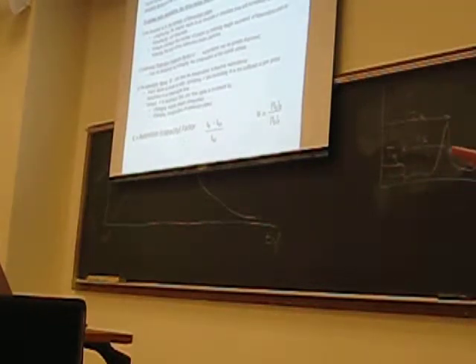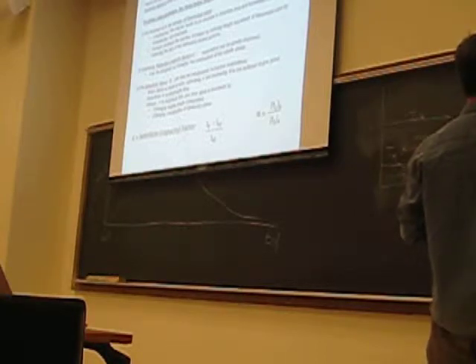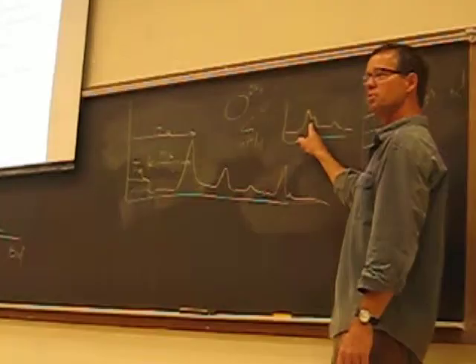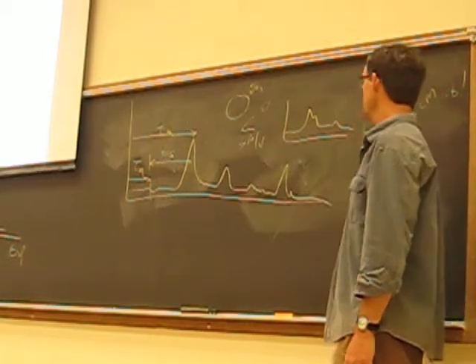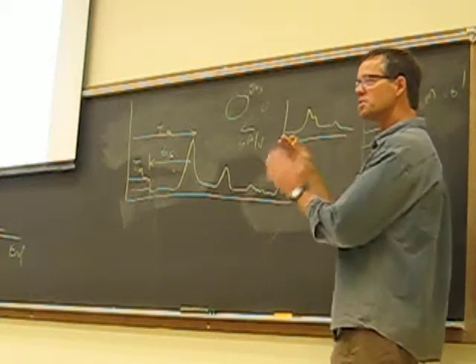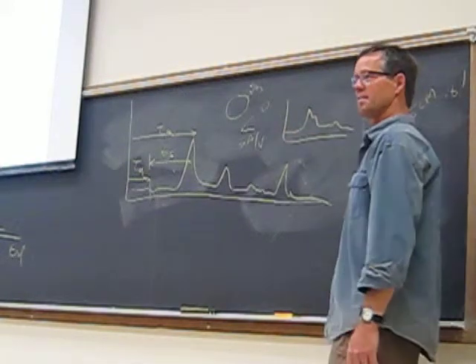So if I were to give you on a test a chromatogram, and clearly you can see that there's poor resolution of two peaks here, and I might say, what do you do? You wouldn't say, oh, well, I'll just slow down the mobile phase flow rate, and I'll just separate. Because of course that won't happen, right? You'll just get a broader double peak.